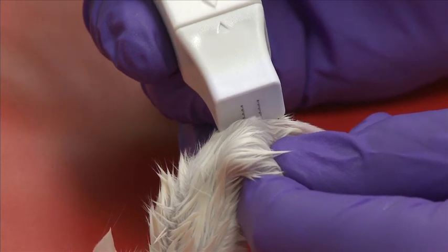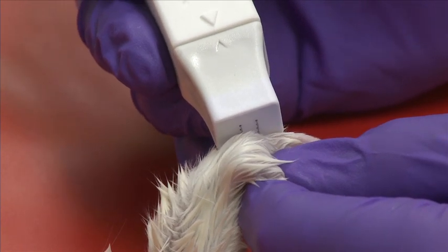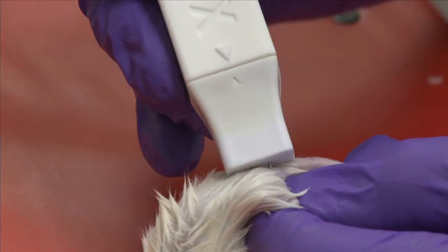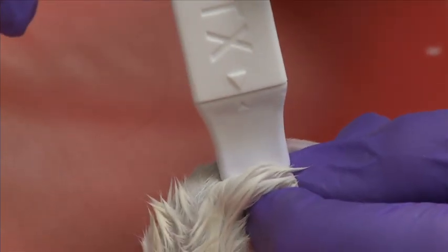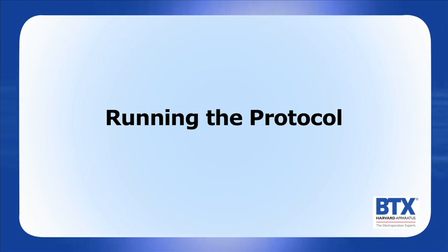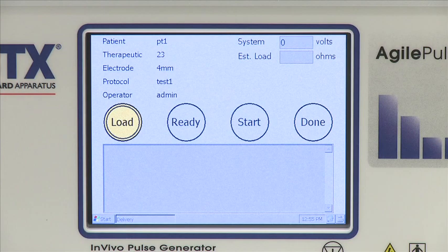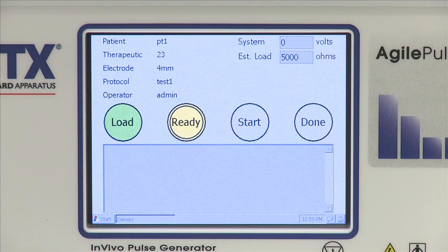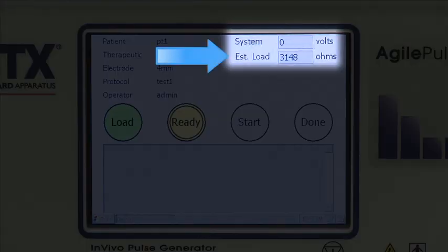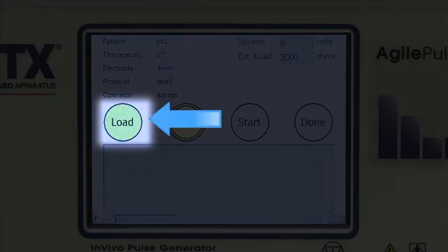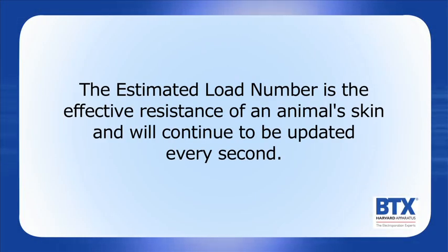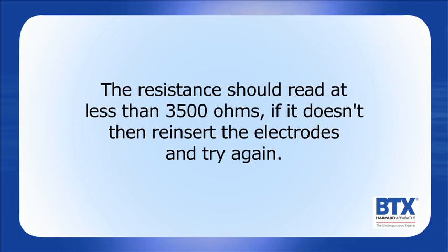For the proper insertion of the arrays, position the needles so they span the injection site and hold at an angle. Push the needles in by rolling forward until the needles are fully inserted. Determine if the electrode is inserted properly by touching the load button. A small pulse is delivered to the electrode to verify that an electrode is inserted. A number will appear in the estimated load box and the load button will change to a green color. This number is the effective resistance of the animal's skin and will continue to be updated every second. The resistance should read at less than 3500 ohms. If it doesn't, reinsert the electrodes and try again.